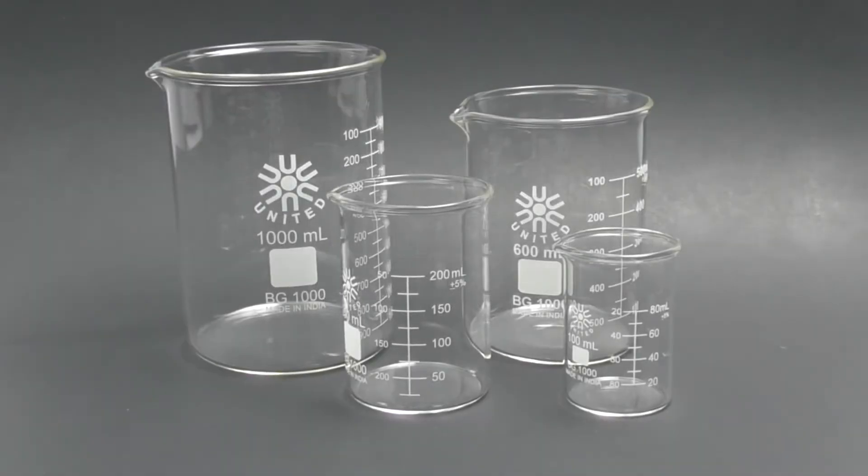If you want to handle liquids and chemicals safely in your classroom, borosilicate glass beakers are the best option.